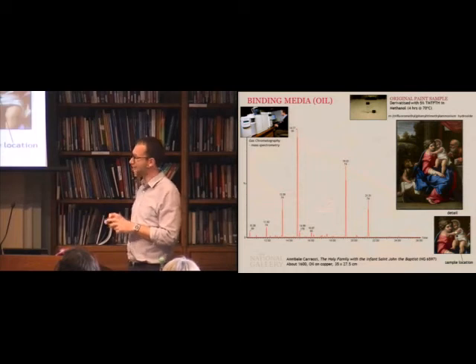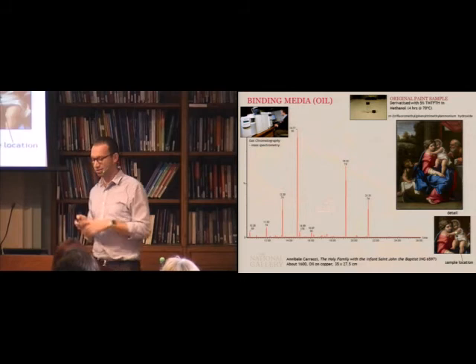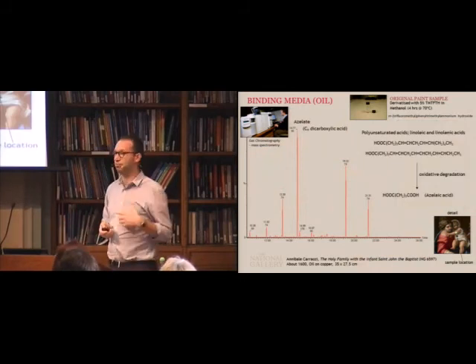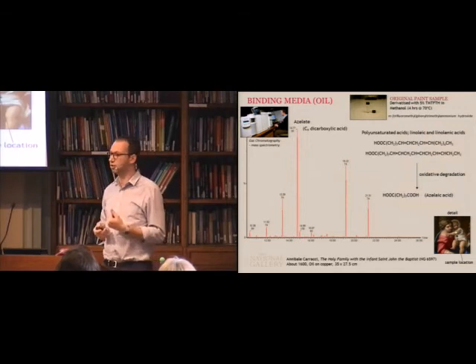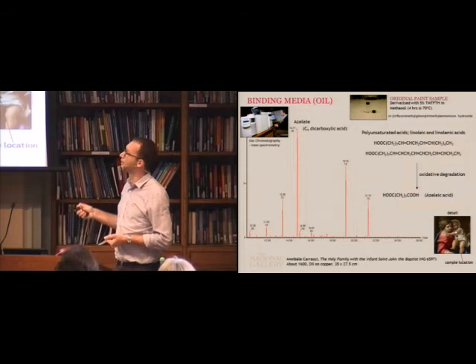Mass spectrum. It's a very busy slide, this. All I want, really, the message of this slide, is just that if I take a sample and run it in my GCMS, I can tell things, because of the different peaks that are available there, I can tell different things about the material I'm running. So because this peak exists, because this azelaic peak is there, that means I've got oil.